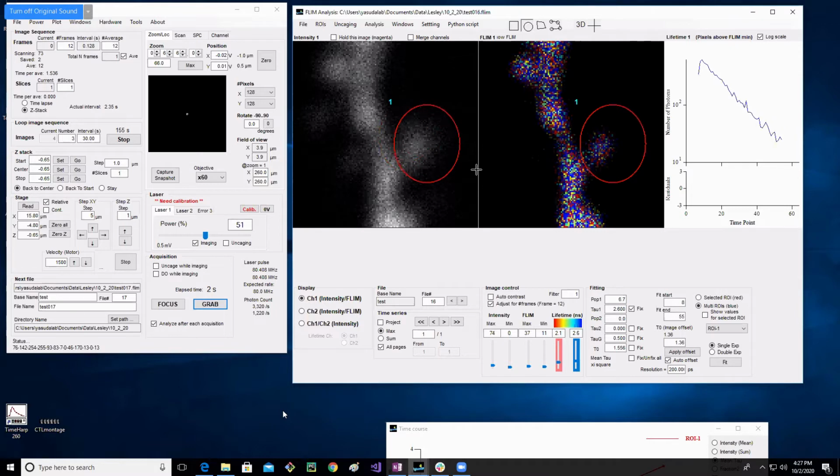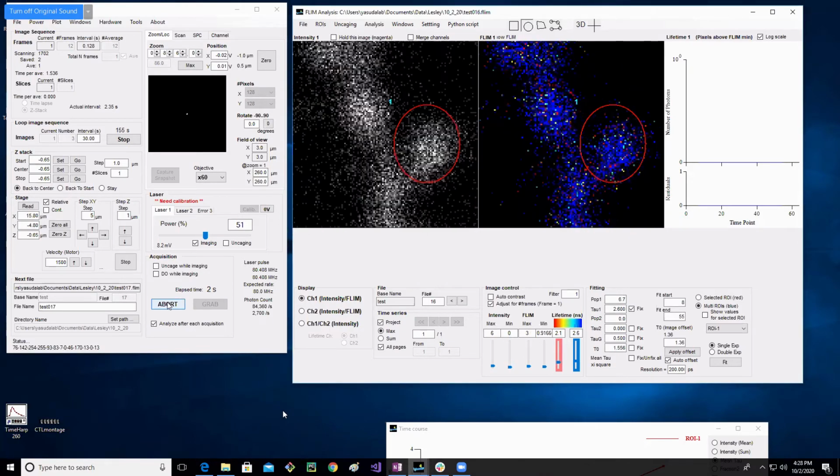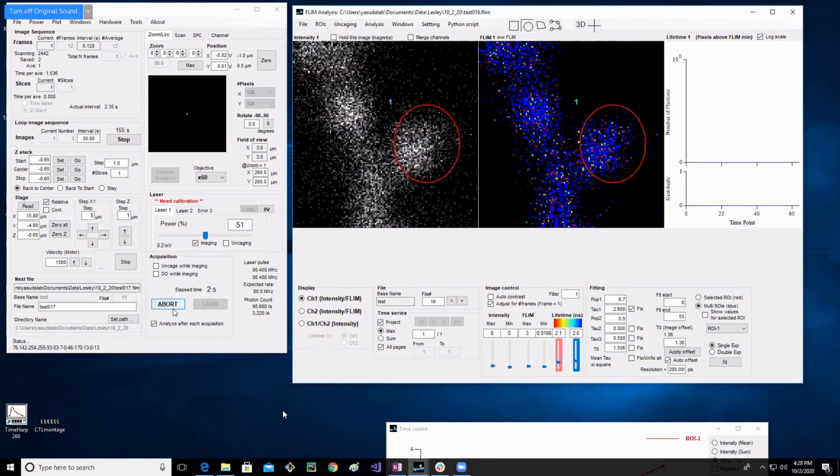All right, so if I'm looking here, I have between 10 to the 2 and 10 to the 3, kind of noisy. But then if I zoom in, I've already zoomed in a lot. I'm at like 60, but let's say I zoom into like 80. Or even a little more.